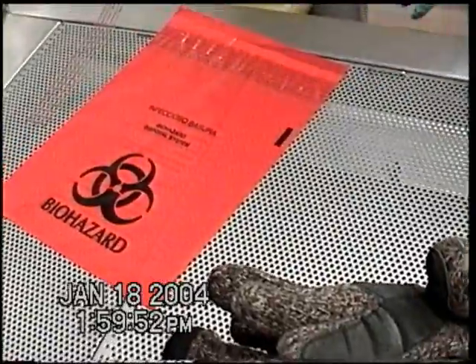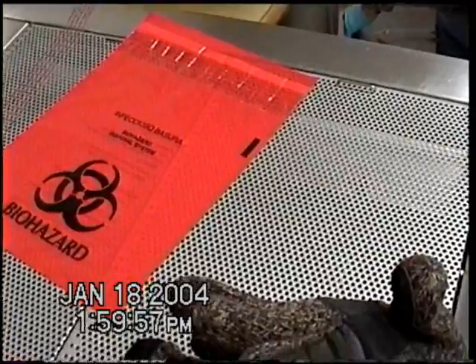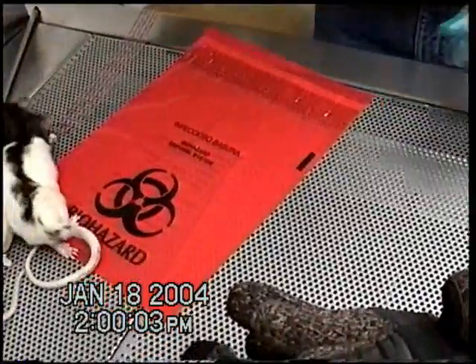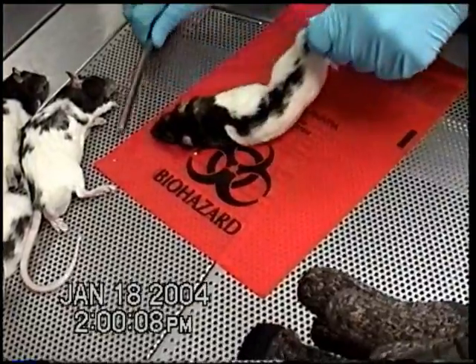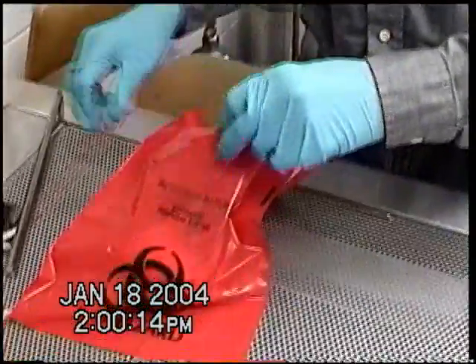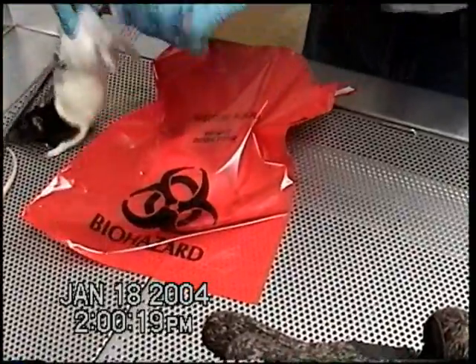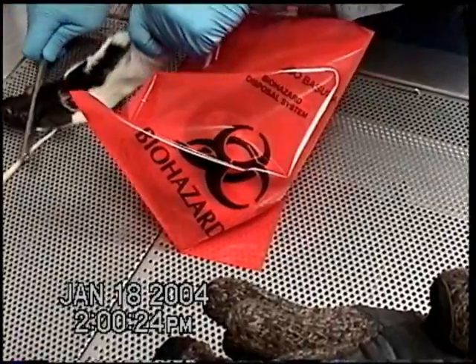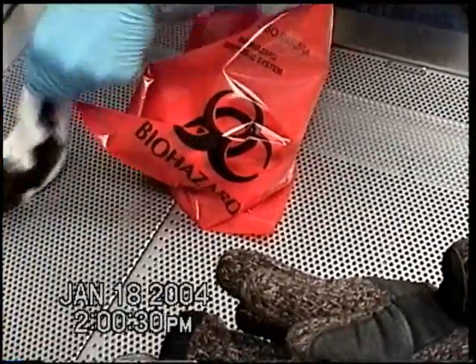Cervical dislocation while they were still alive? No, they are not. Because if they are kind of still gone, they are definitely dead. But this is to assure the second means that they are dying — this is assuring. That's all it takes. This rod is for that purpose.